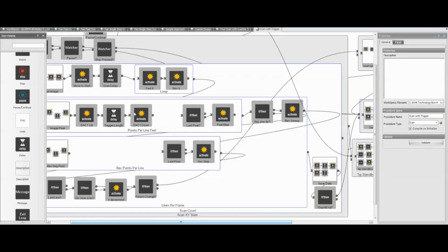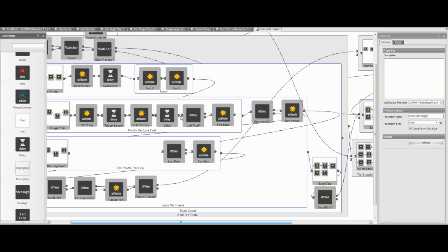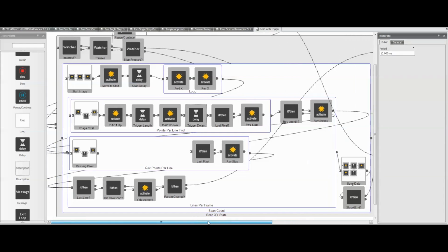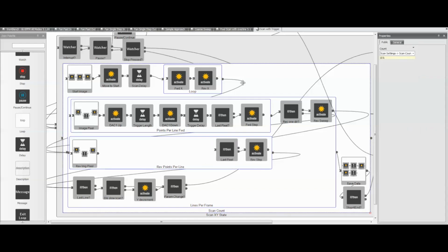Okay, we'll add another delay here. And we'll call this trigger, we'll call it trigger delay. Okay. So now I'll expand this other one here too to make room. All right. So I want to have 2 configurable delays on this procedure panel.